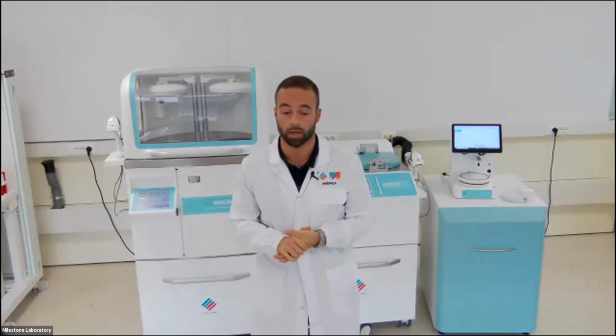Well, it depends on the characteristics of the specimen, because if you have a small biopsy, we have protocols that last 45 minutes, including fixation. For bigger specimens, like 5 millimeters thick, we have a 13 hour process protocol.